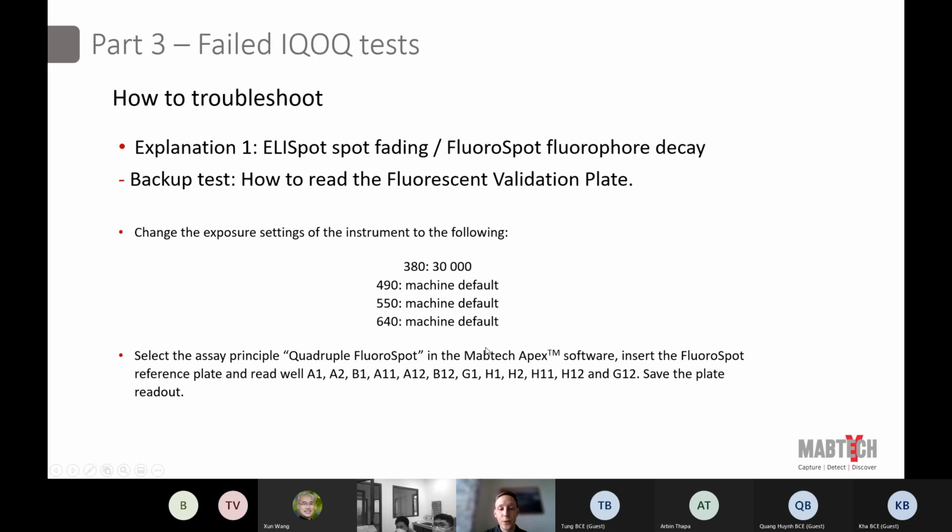So I'm not going to go through all the details right now on how to read this extra calibration plate. We will take that when we have the service training, because this calibration plate is included in the service of Iris equipment. But you don't really need to worry about it right now because you have only bought an ASTOR. So this step is redundant for ASTOR.